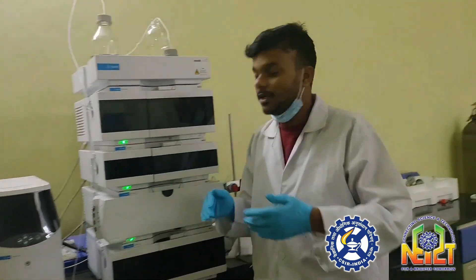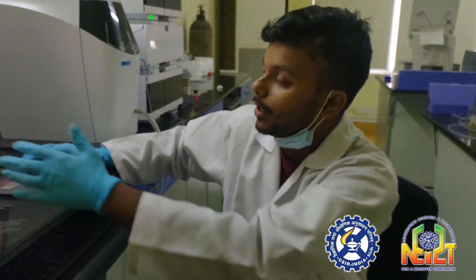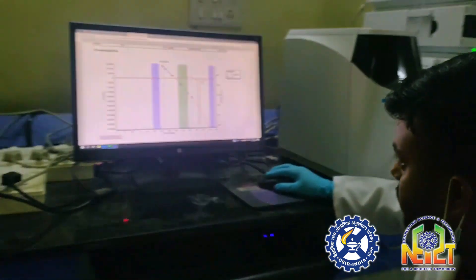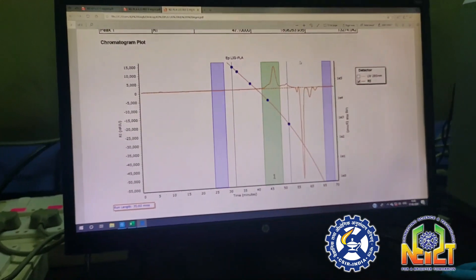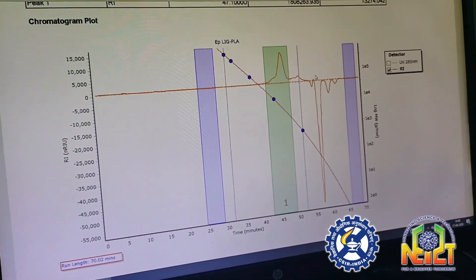We get different peaks, and these peaks are then plotted against the standard to give the molecular weight distribution of the polymer. After completion of the runtime, we get peaks plotted against the standard — in this case polystyrene — from which we can determine our molecular weight. Thank you.